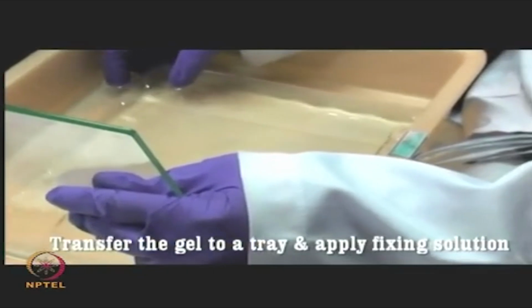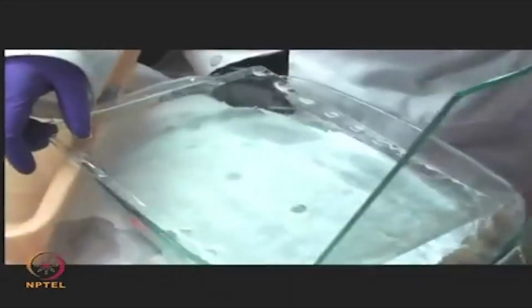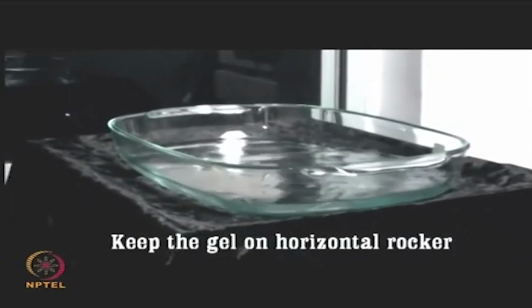Then, transfer the gel into the fixing solution by gently sliding it off from the glass plate. Place the tray on a mechanical shaker for an hour to ensure that the protein spots get fixed onto the gel, thereby minimizing any diffusion.